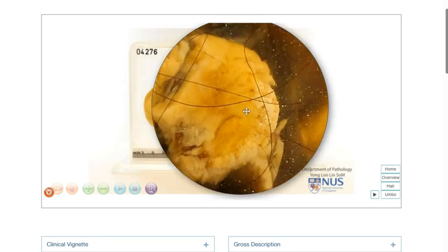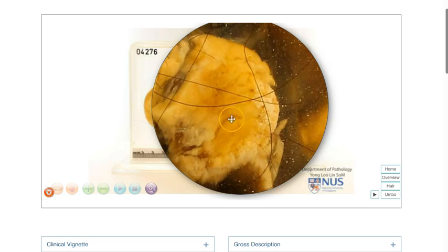We also notice that the cut surface of the umbo appears quite yellowish. This is due to the presence of fatty tissue or adipose tissue.